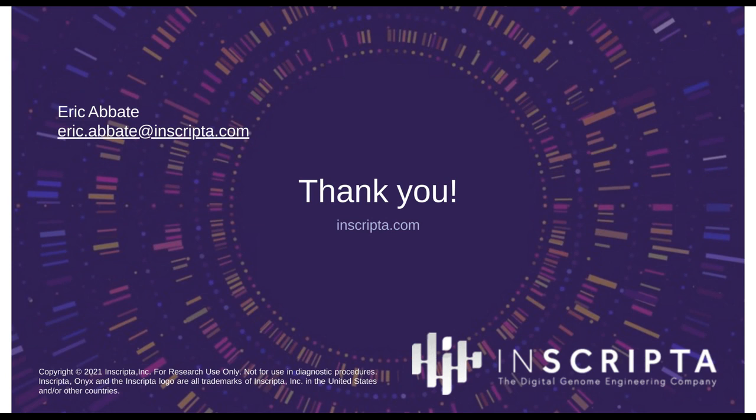Great, thank you. Our next question asks, genotyping is by sequencing amplicons? Yes, so there's a couple different strategies you can use. You can either sequence the barcode to identify the edits contained within that hit, or you could do whole genome sequencing. We've used both strategies in identifying hits, so both of those are possible.